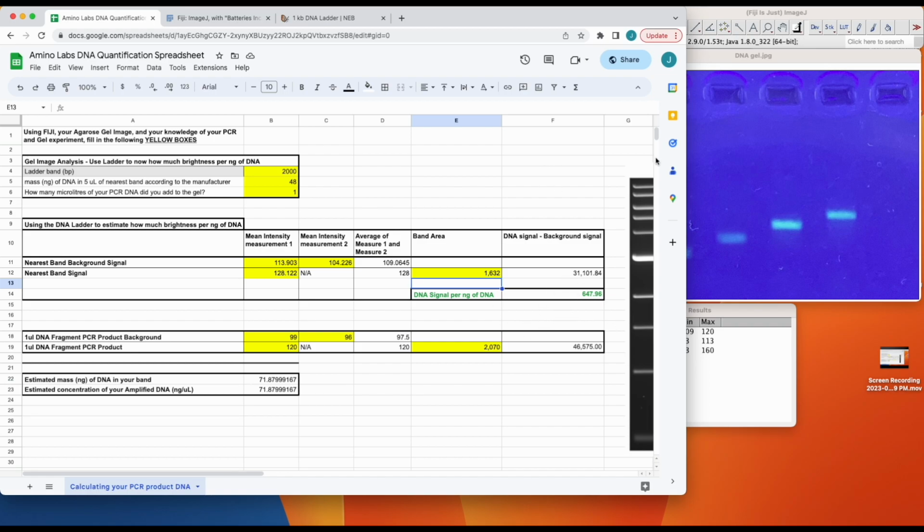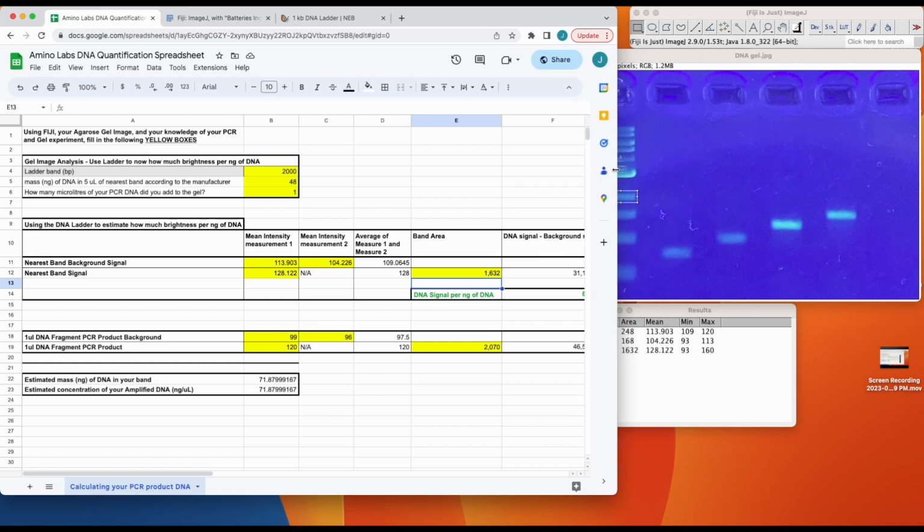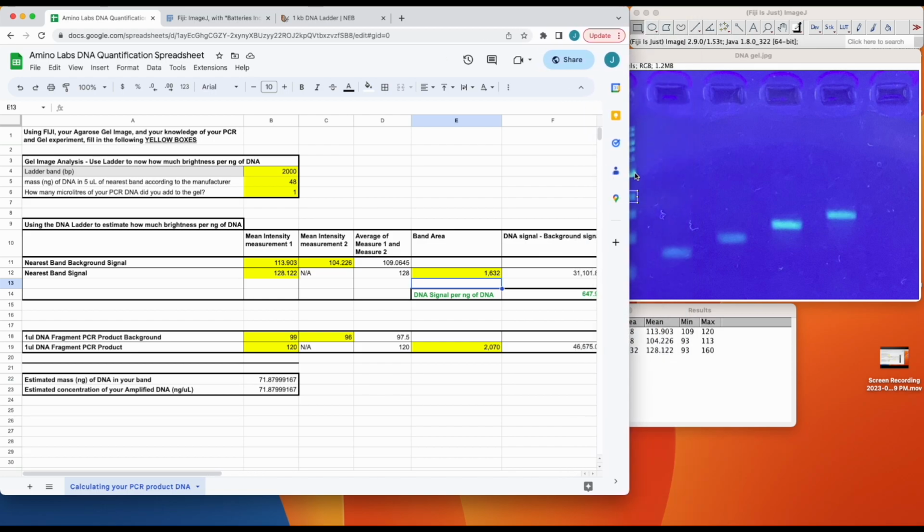But this doesn't really mean too much for us in general. This will really depend on your image, the camera that was used, the resolution, etc. So yeah, this can be a little bit all over. So don't worry if your numbers are very different from someone else's.